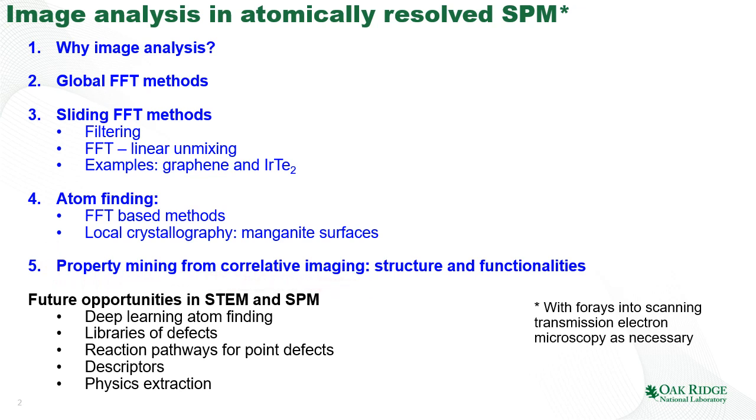After that, I'm going to briefly discuss property mining from correlative imaging. In other words, how can we combine the information from structural image and functional image to get some insight into the structure-property relationship in the material.